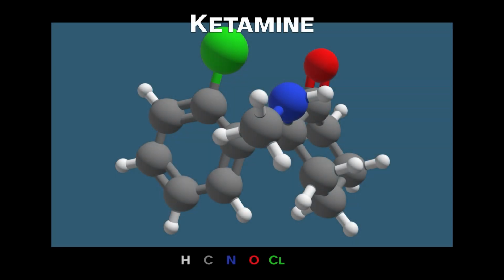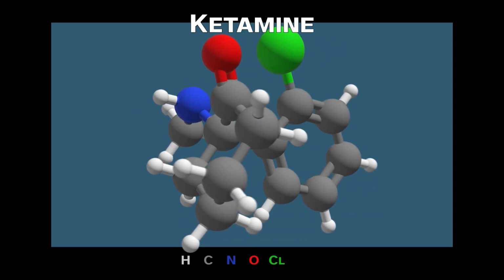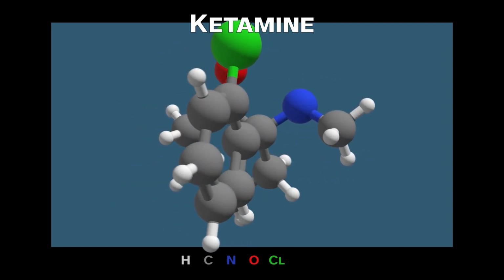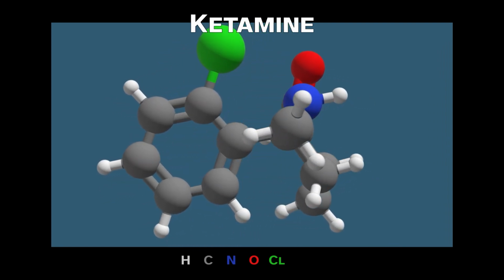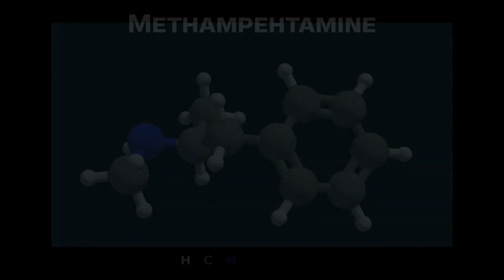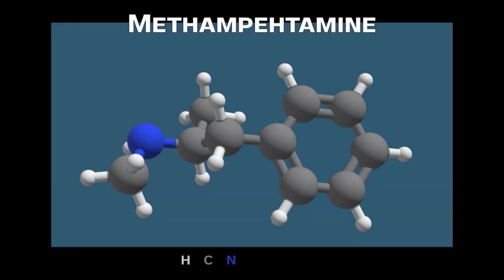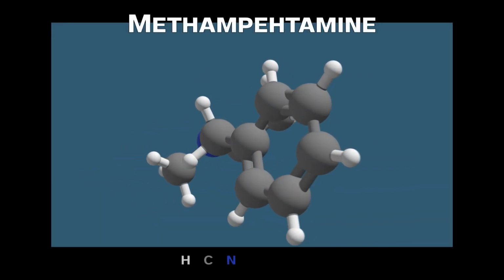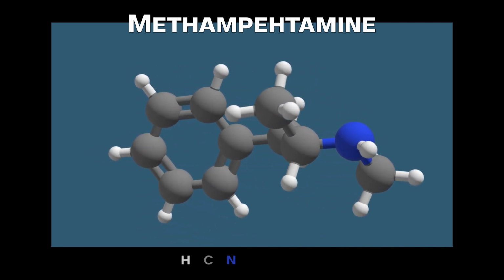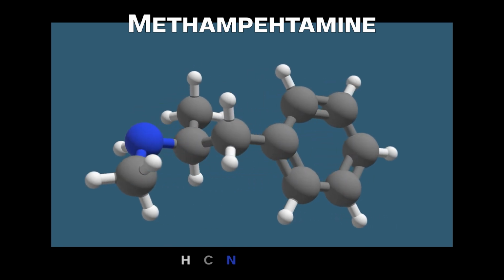One of HPLC's strengths, or differentiators, from other analytical techniques is that it works at room temperature in a solvent, where many other analytical techniques need their analytes in a gaseous state and require specific sample preparation. The more complex compounds, like drugs, rapidly degrade at high temperatures, and at that point are difficult, if not impossible, to isolate and detect.